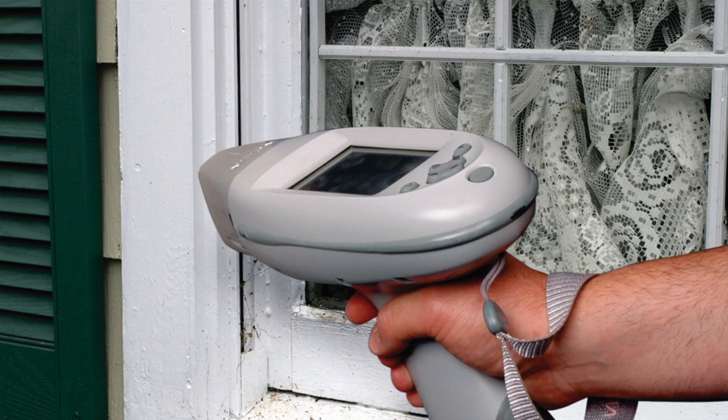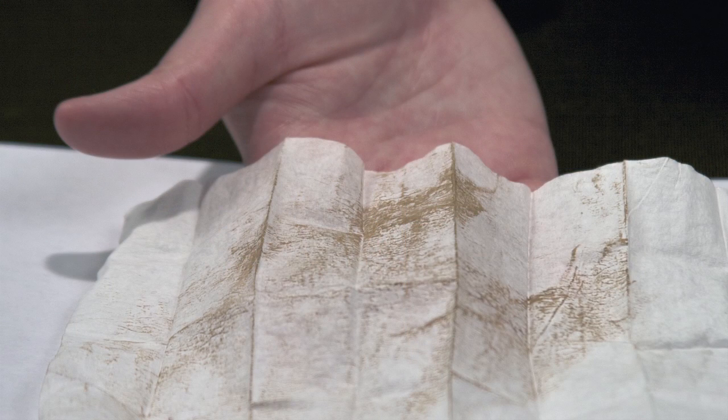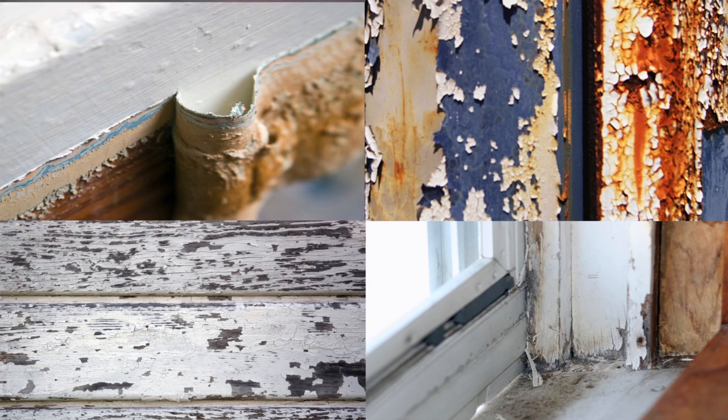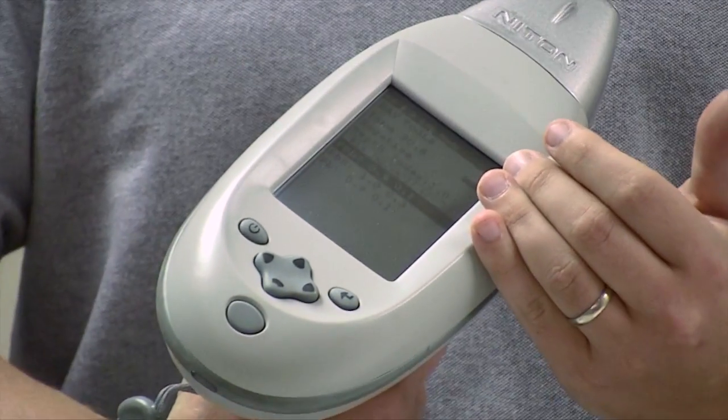These handheld analyzers provide many distinct advantages, including rapid RRP rule compliance testing, soil analysis to evaluate outdoor risks, and dust wipe analysis to pre-screen abatement or renovation work.